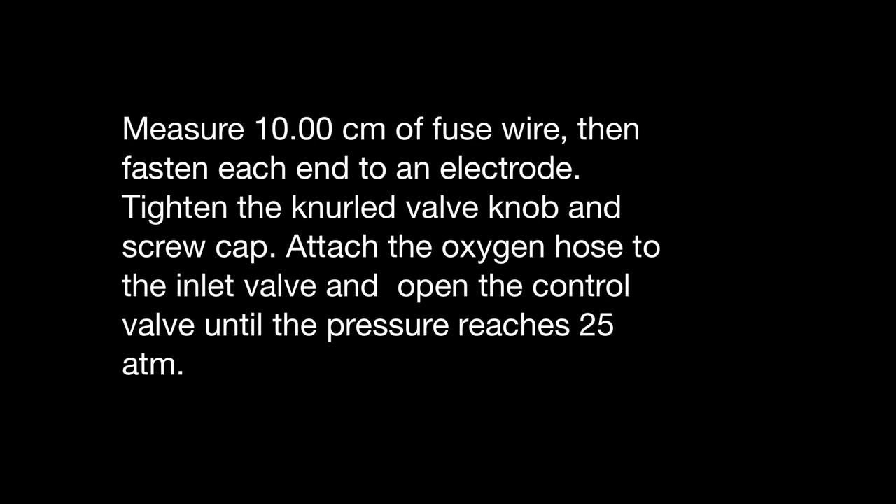Measure 10 cm of fuse wire, then fasten each end to an electrode. Tighten the knurled valve knob and screw cap. Attach the oxygen hose to the inlet valve and open the control valve until the pressure reaches 25 atm.